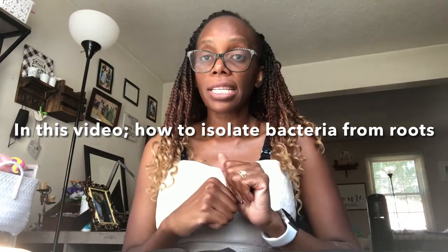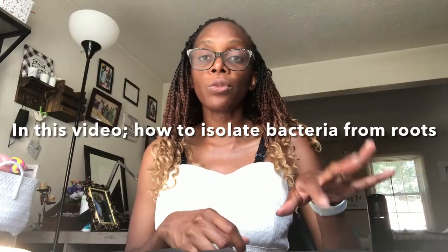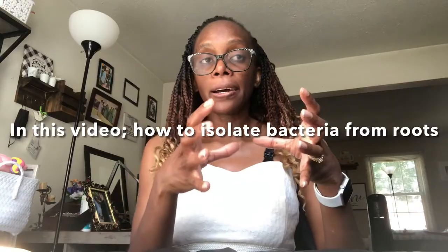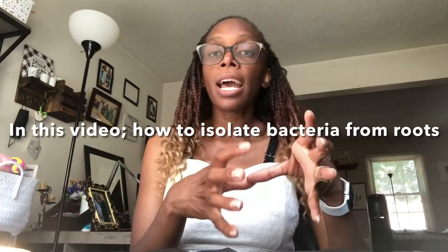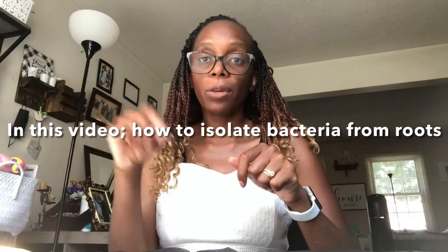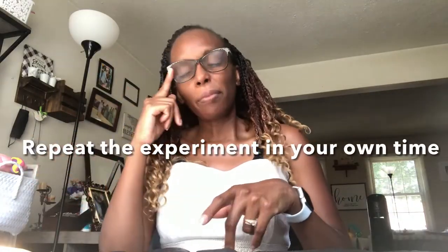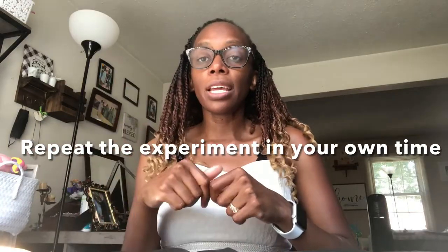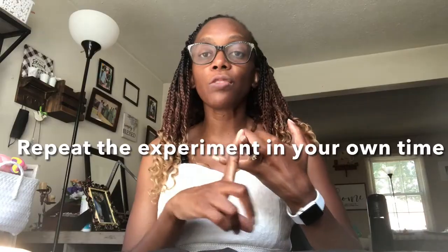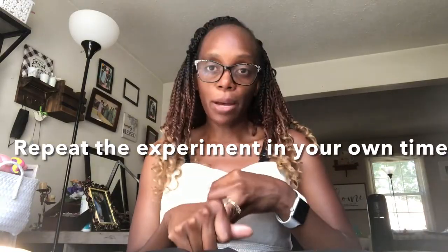We did this yesterday in class, and for every experiment that we do in class, we do an experiment in one location or one pot, and then in your own time you have to repeat that for the rest of your pots, so that by Sunday you update your eLab notebook, and you also take photos and update them in your photo uploads.